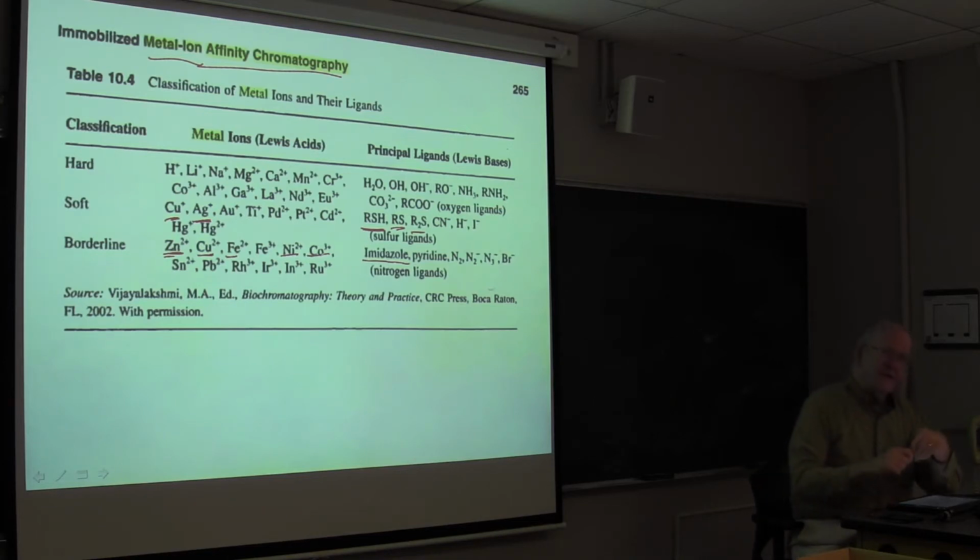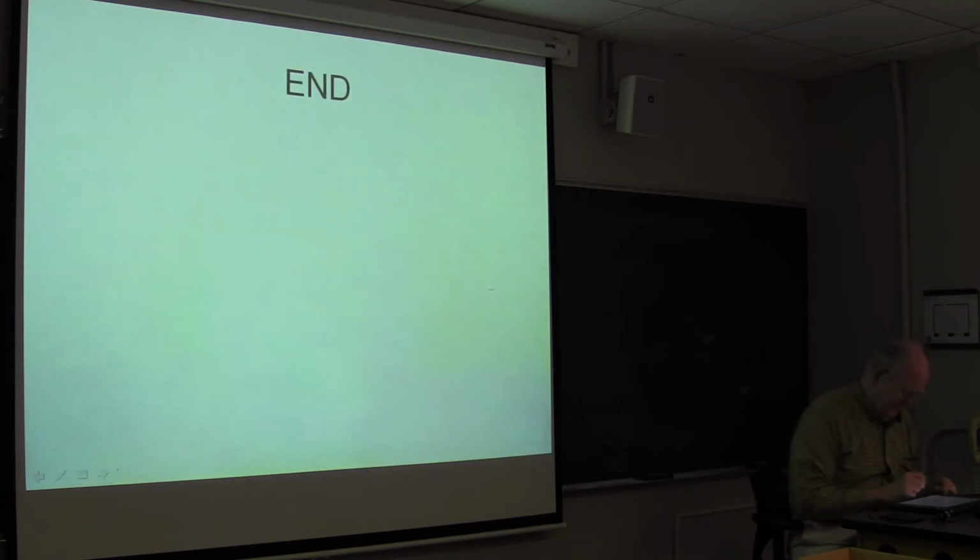So this kind of chemistry is very exploited in doing chromatography. Perhaps more so in LC than in GC, but definitely people have put silver and mercury predominantly into GC phases to fish out things with pi electrons in them. And even halides like iodides, because iodides are so polarizable, they will hang up on the silver. I really just scratched the surface here, because anything you can think of that organic chemists or inorganic chemists have done in terms of charge transfer, complex formation, we're going to try and exploit that one way or another as chromatographers. It's a very important area. I wish it were better understood, but that's where it is right now.